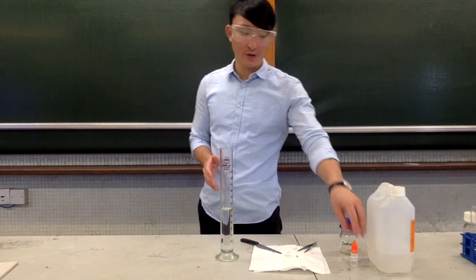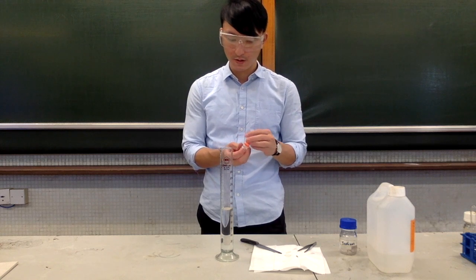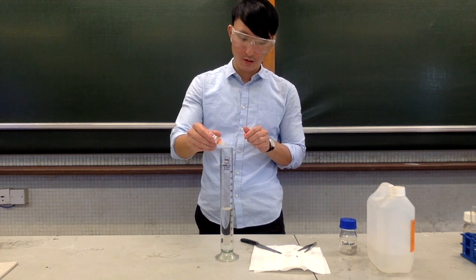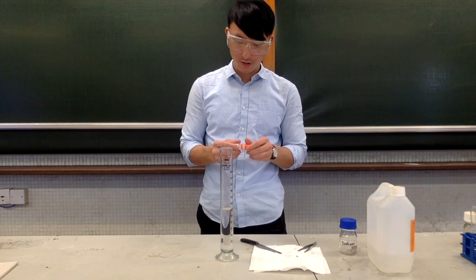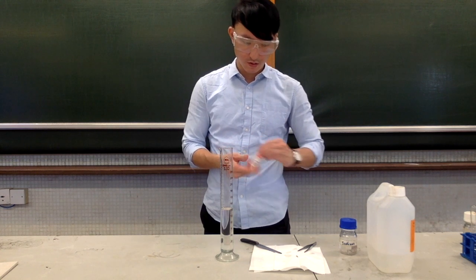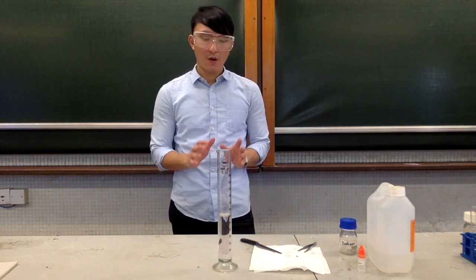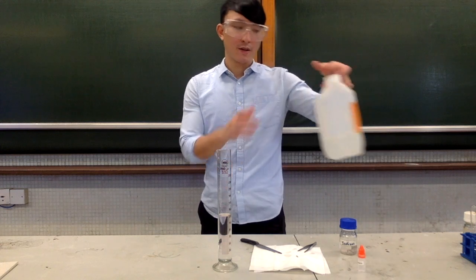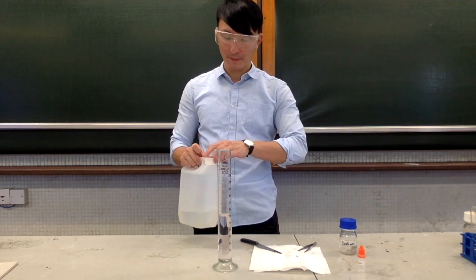To that, we are going to add a few drops of phenolphthalein. Now, we are going to add paraffin oil to the top of the water.